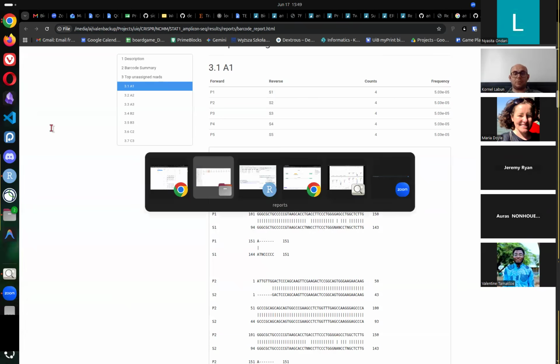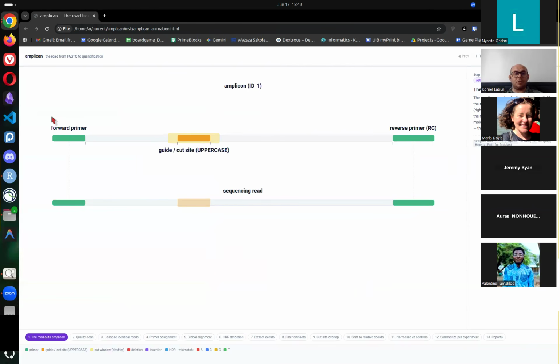So if we go back to our view here, very often this happens when people design their sequencing experiments. They're going to put 150 base pairs from here to here, and from here to here is going to be another 150 base pairs. So they want to capture 300 base pairs of information with 150 base pair sequencing. That's a mistake because normally that could work, but for CRISPR, if the cut is here, imagine the cut is being done here.